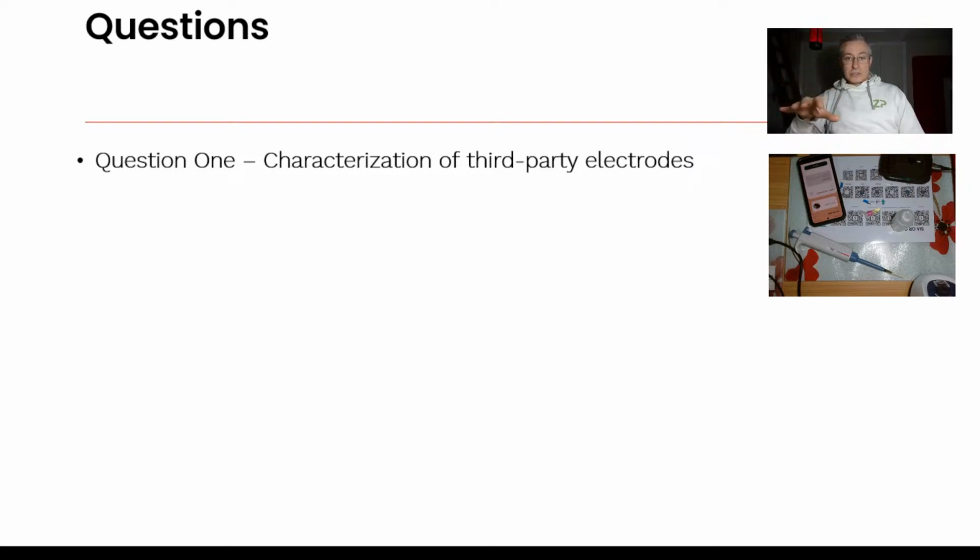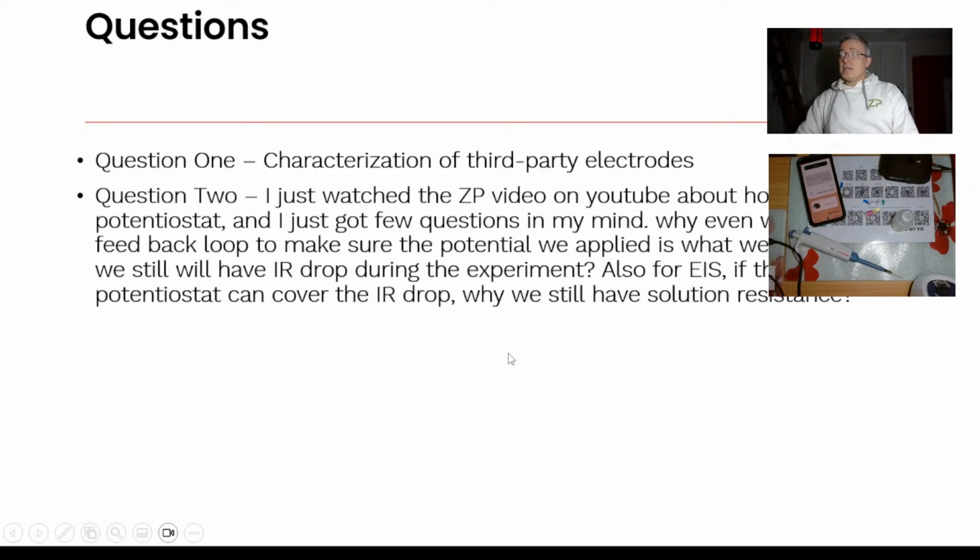Now, it's no criticism of the electrodes, but we didn't get the world's greatest data. But I just want to talk about when you don't get great data, for example, in this case, it's cyclic voltammetry. So it'll help you troubleshoot cyclic voltammetry a little bit.